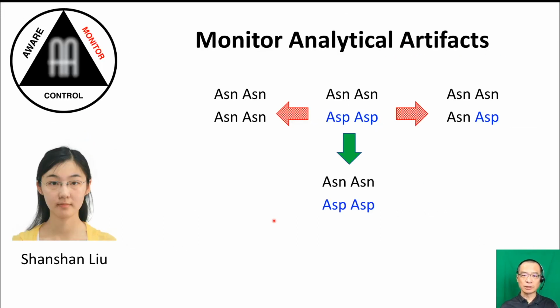So here, I summarize the issue. In the middle is the observation someone can have: it contains asparagine and the deamidated species only shows aspartic acid, not isoaspartic acid species. But this observation can be interpreted three ways. Maybe the original sample is all asparagine, right? Shown on the left. So then the observation is artifact. Or to the right, the initial, authentic sample has a little bit of deamidation to aspartic acid, but during analysis has much more. The only case where this analytical result truly reflects the sample is if there's no deamidation during sample analysis.